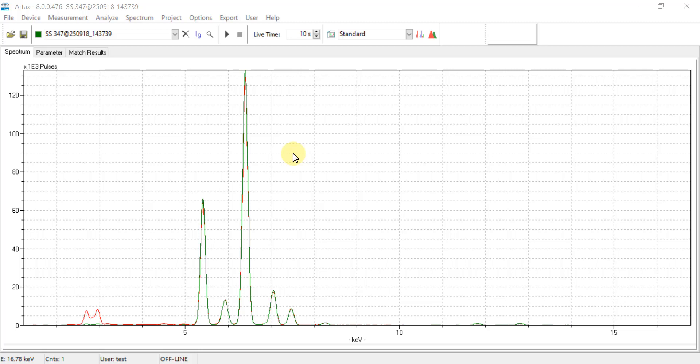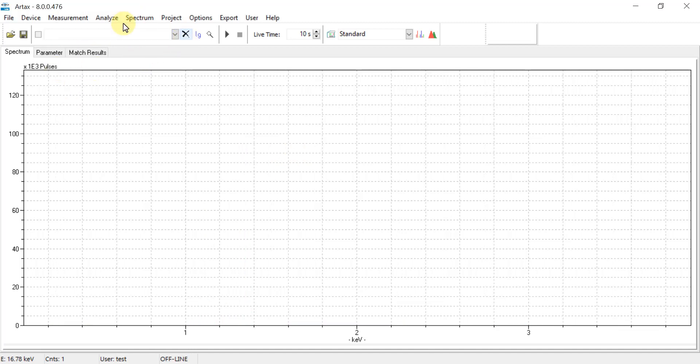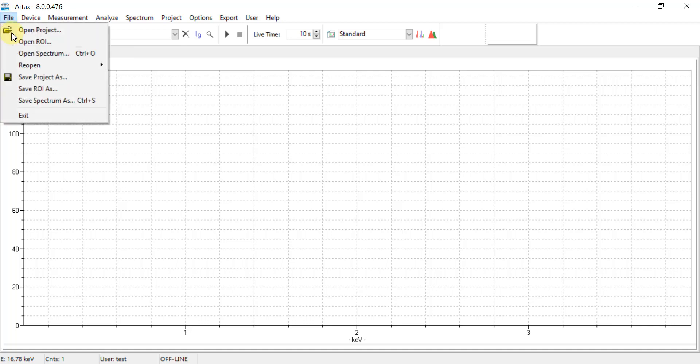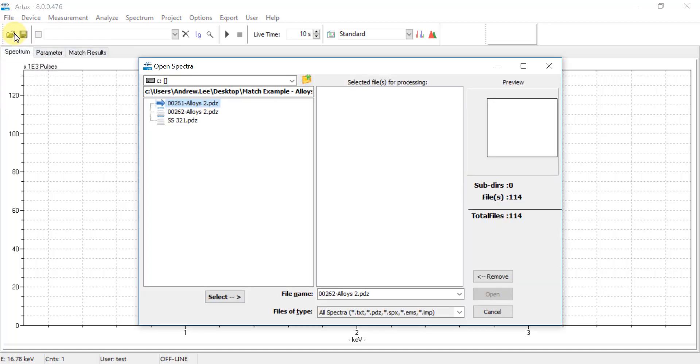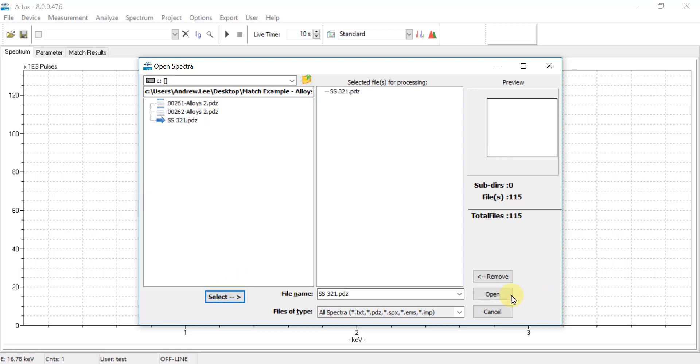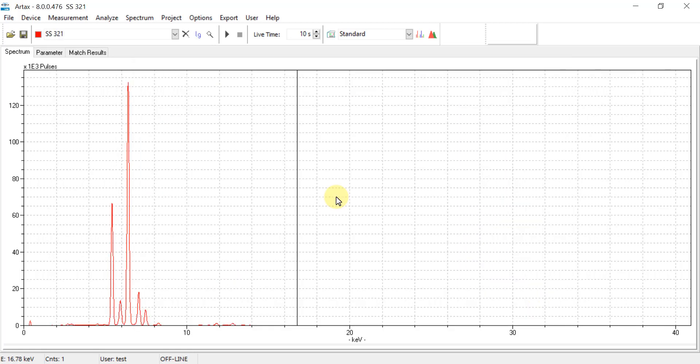If the user would like to add any PDZ files to an existing library, simply clear out any existing spectra from the spectrum viewer and then go to File, Open Spectrum, and then select the PDZ file you would like to add. In this example I will select stainless steel 321 and open that.